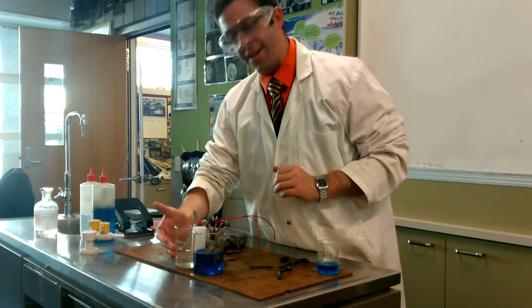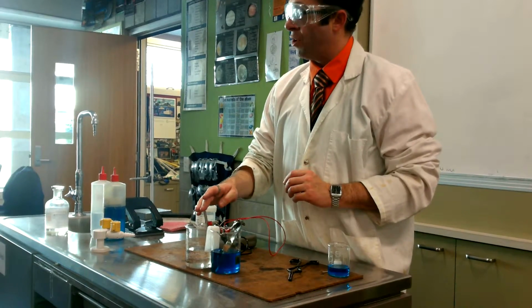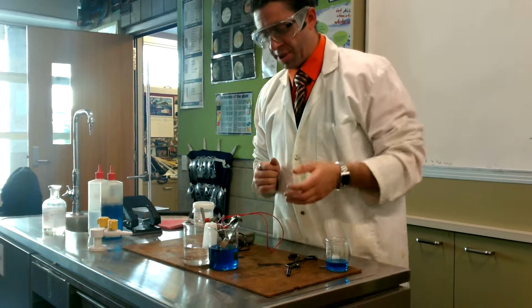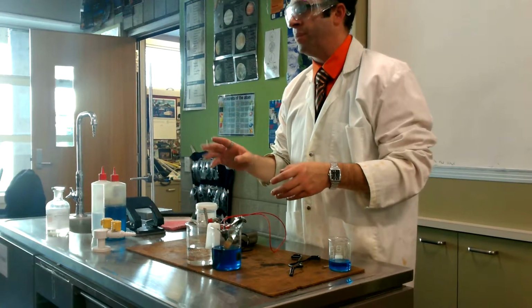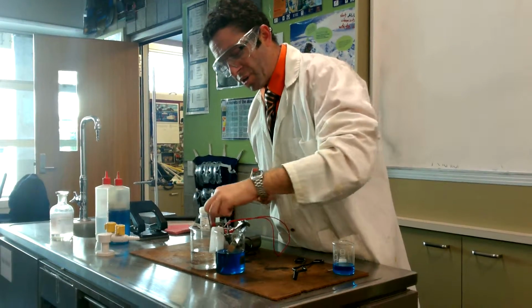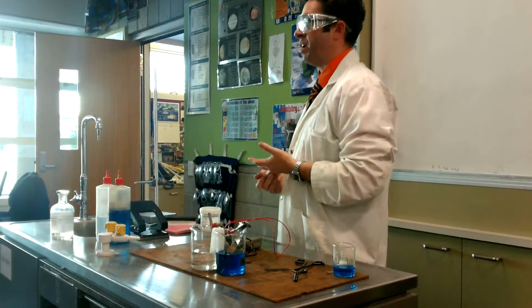Over here I've got a zinc solution with a zinc electrode, just a piece of zinc with a wire connected to it, a zinc electrode in it. Here I've got a copper solution with a copper electrode, piece of copper bound to a wire, that's what it means, with a copper electrode in it. You'll notice I've got a bit of paper connecting the two of them. This thing here is called a salt bridge. I've made it with some filter paper that I've soaked in potassium nitrate.